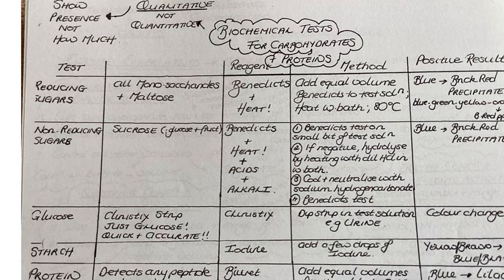Hello everybody, I'm just going to talk you through the biochemical tests for carbohydrates and proteins that you need to know for AS3. So the first thing to point out is these tests are qualitative, and what that means is they just show if something is present or absent. They don't tell us exactly how much of a substance is present. A test that would show that would be a quantitative test.